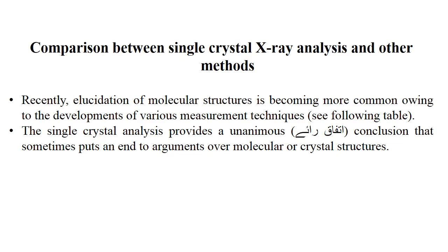By NMR, MS, and IR, we have the difficulty to deduce the three-dimensional structure of the whole molecule. We can get only the information about the structure, but we cannot get the three-dimensional pattern. But by using single crystal X-ray analysis, we can get the three-dimensional structure of the molecule or the crystal also.